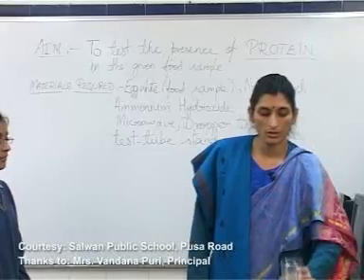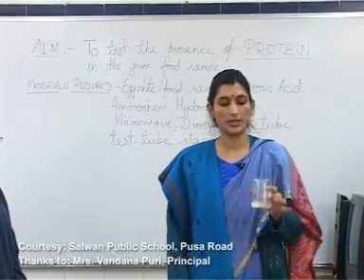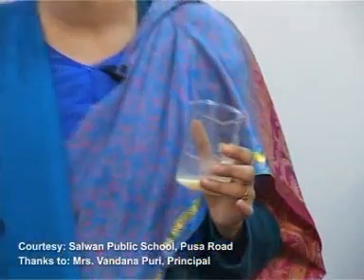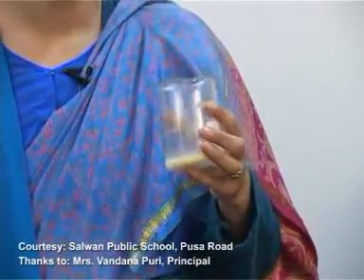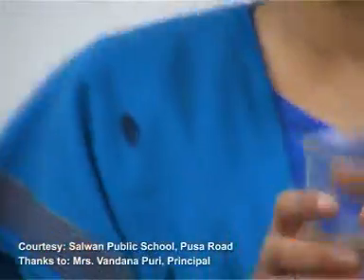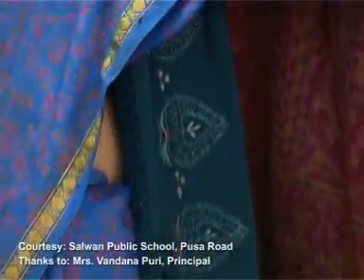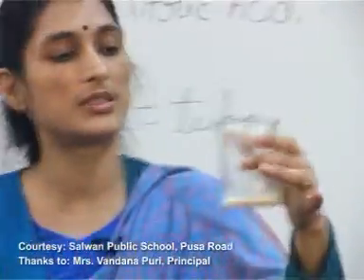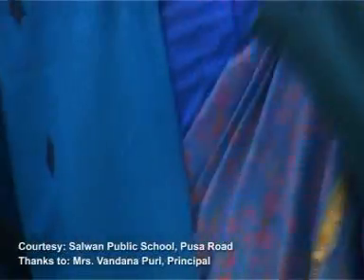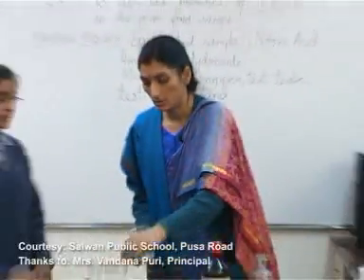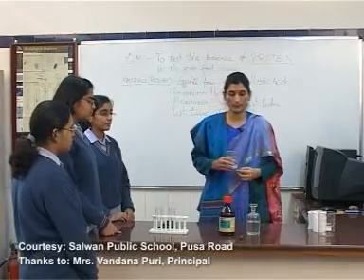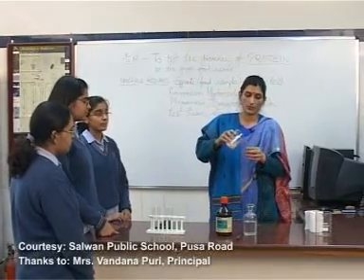This is the food sample. Which part of the egg is rich in protein — the yellow part or the white part? The white part. So naturally we have taken the white part, though a little bit of yellow has also come into this solution. We will now test this for the presence of protein, taking around one ml of the sample approximately.